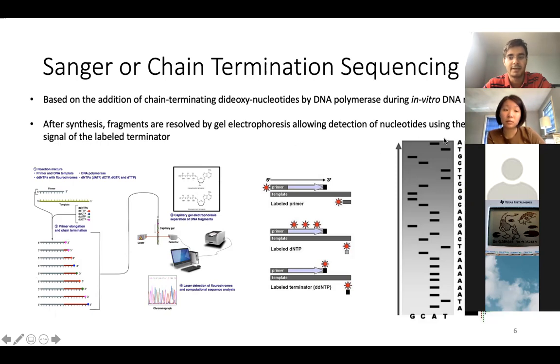And it turns out that this one is read in the gel electrophoresis in a region like this. I am assuming the migration is happening from bottom to top, as far as the arrow indicates. So one short fragment like this would end up here in the north, as opposed to the bigger fragments that end up here at the south. Does this make sense?